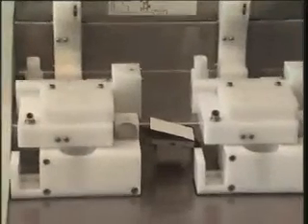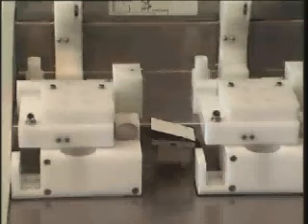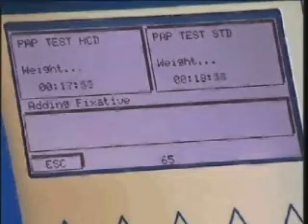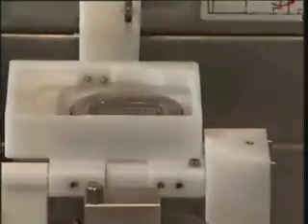The process is continued by transferring the membrane to the slide, and the cells are fixed on the slide by a weight and air bubble system. During the cell transfer, the two towers are automatically rinsed and cleaned for performing another two slides.